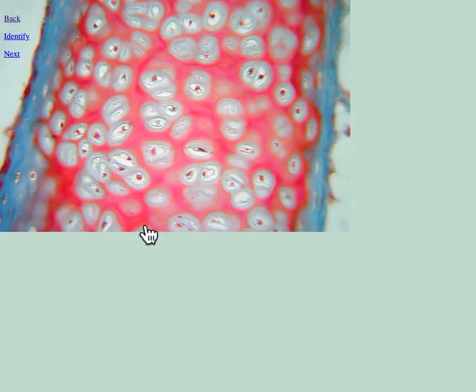So here we are. Again, there are three types of cartilage: hyaline, elastic, and fibro. And how do you tell the difference? Well, number one, the first thing you want to determine is, is it a cartilage? And if it's a cartilage, you'll see a lacuna with a chondrocyte, a lacuna with a chondrocyte, a lacuna with a chondrocyte. If you see a lacuna, you're dealing with a cartilage, and the chondrocyte is the functional cell. Now, looking in the matrix, I don't see any fibers, and therefore this is hyaline. This is not to say there aren't fibers in here, but with the staining procedures that we're doing, they don't show up. And so when you don't see fibers, you're dealing with hyaline cartilage.